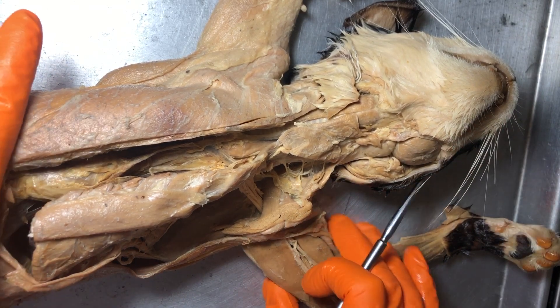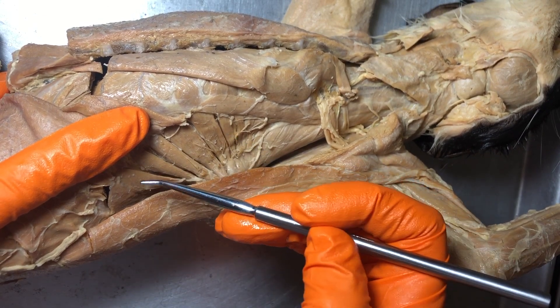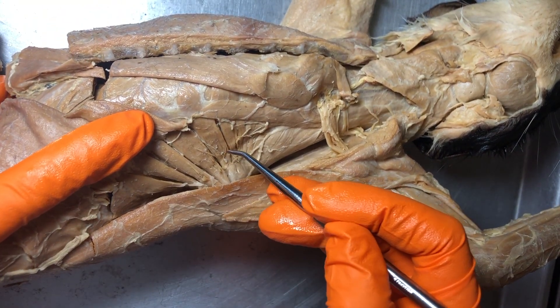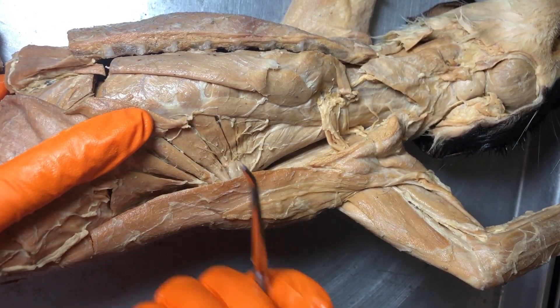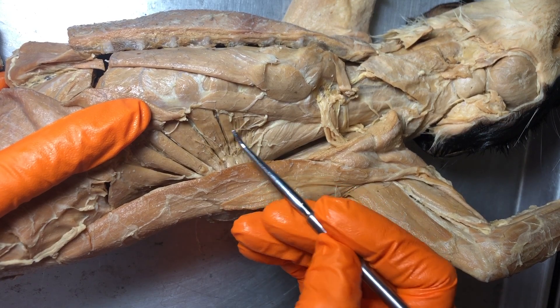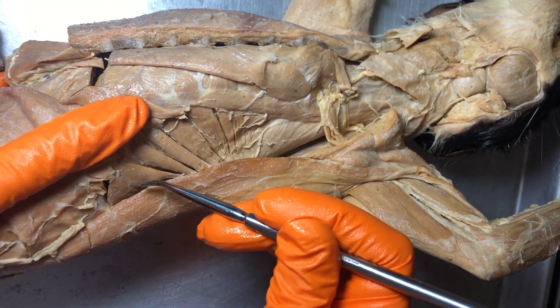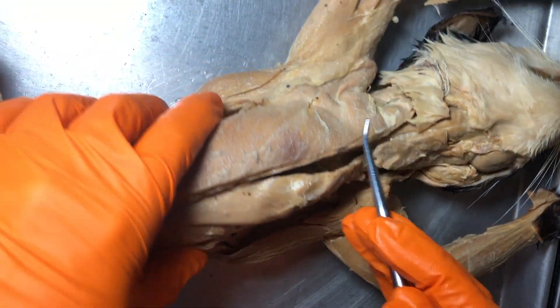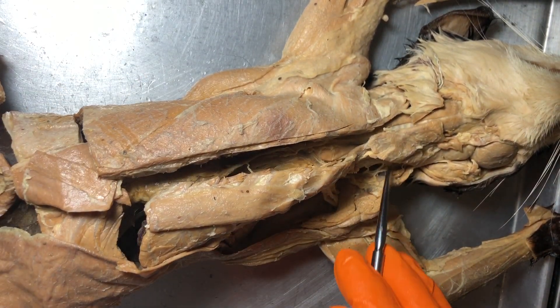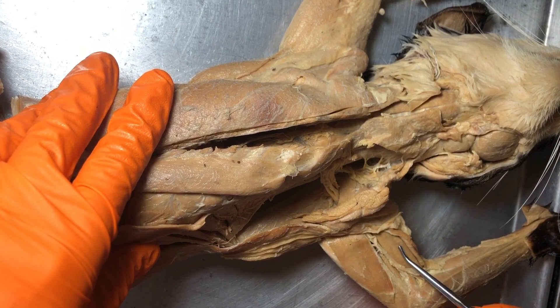Another muscle to point out is this serrated muscle called the serratus ventralis — remember 'ventral' because it's the belly side. On us we call this the serratus anterior, because it's the anterior side on bipeds, on humans. 'Serratus' refers to the serrations you can see here. Quick review: the left serratus ventralis, the right pectoralis major, the left sternomastoid, the left masseter, left biceps brachii, left triceps brachii.